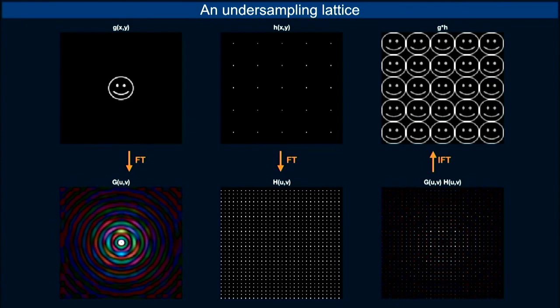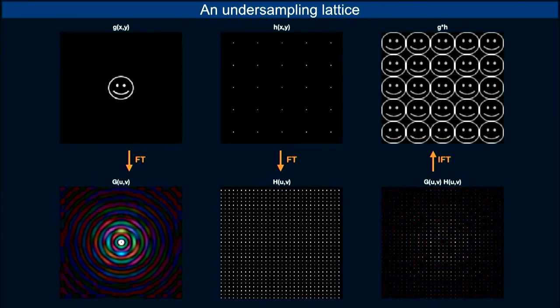When I multiply this by this, I get this Fourier transform, and I transform back, I have my motifs too close together. They're overlapping, and this is a sort of aliasing where the information at the extreme edge of one copy of the motif is interfering with the adjacent copy of the motif. And so we have aliasing when we have sampled too seldom.